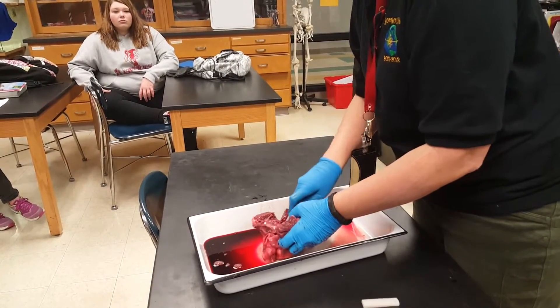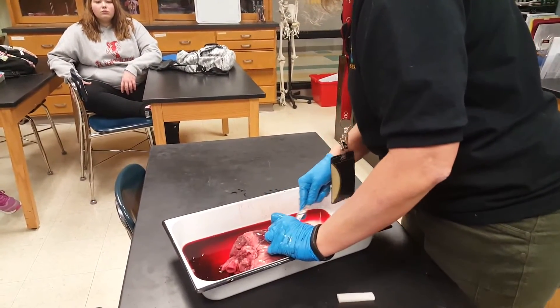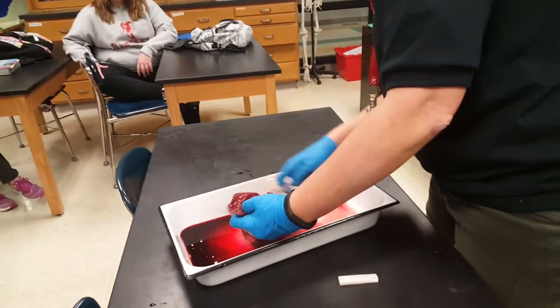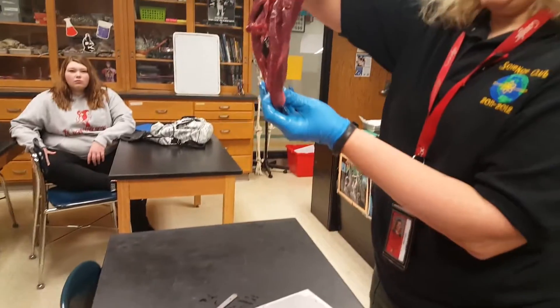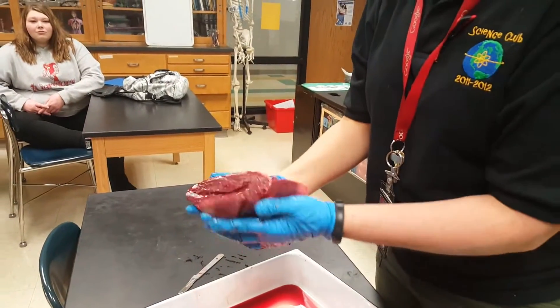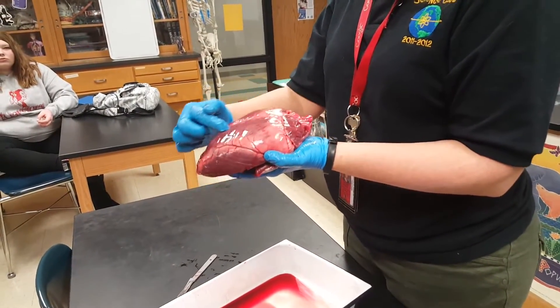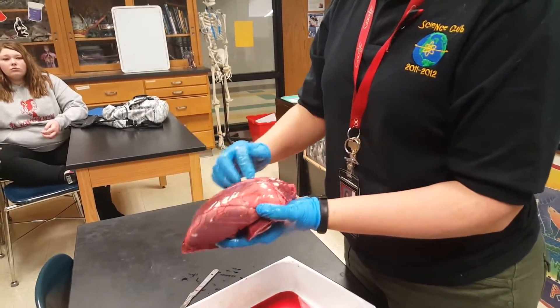Let's continue going through. We'll get to the right side of the heart. Now we've got to reorient ourselves. Here is the front of the heart. You know what that line is called? It's the intraventricular sulcus, and that gives us the front of the heart.